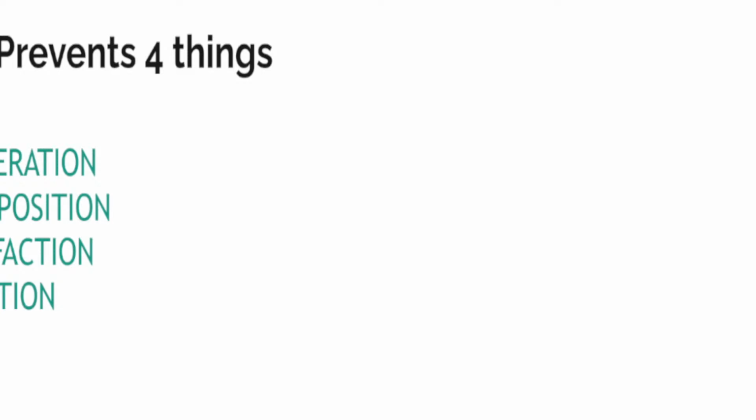Okay? Degeneration is the dying of the cell, decomposition is when cells rot, and putrefaction is when there's a stench involved and chemicals are imbalanced. And distortion is when you stain it and you don't see what is usually observed in a well-fixed sample.